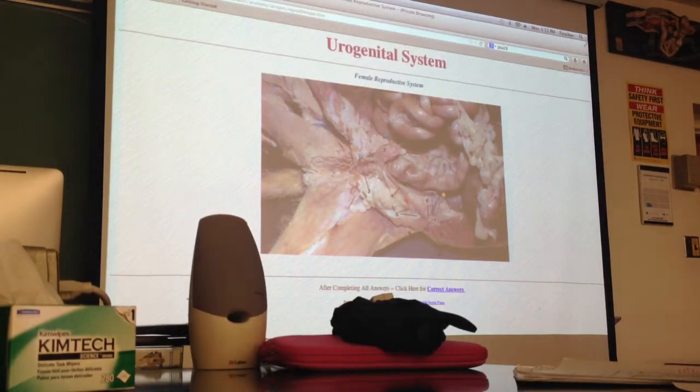Half of the bean is going to have a tissue that's a little bit thicker, so there's going to be something sitting on top of it, and it's usually lateral. Usually you'll find that the fallopian tube is going to be in the lateral portion of the ovary, and then the medial portion of the ovary is going to be exposed ovary. Like I said, here you can see that they've actually pulled it back with this pin. We're not going to be doing that. We're just going to leave it right on there because it's hard to do that part of the dissection because it's so tiny.